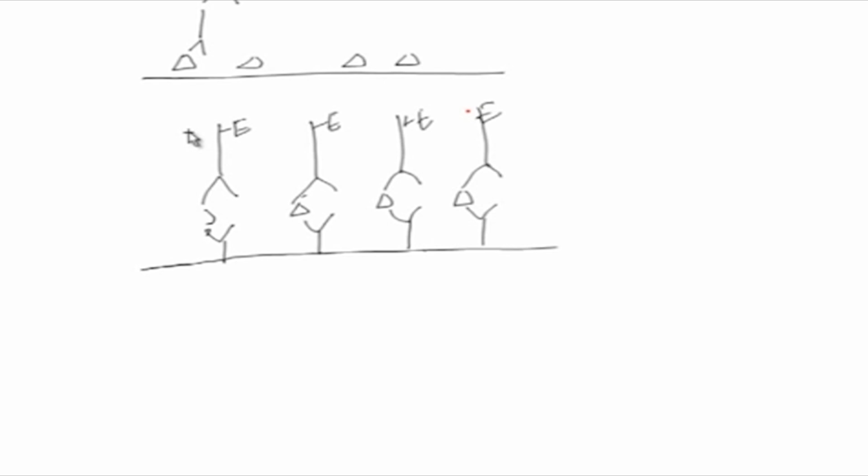Now, when you add substrate, the substrate will be converted to product, and the product gives a particular color, which could be quantitated or just measured for qualitative purposes, and will give you an idea about that particular analyte both qualitatively and quantitatively.